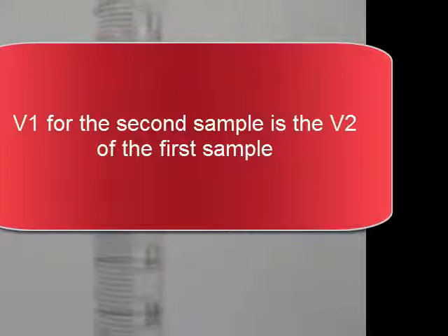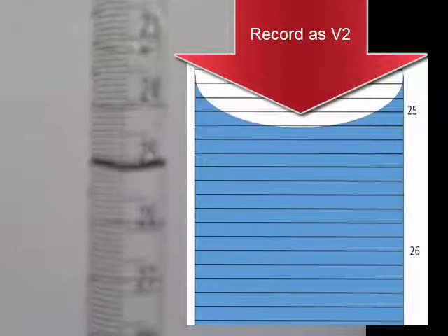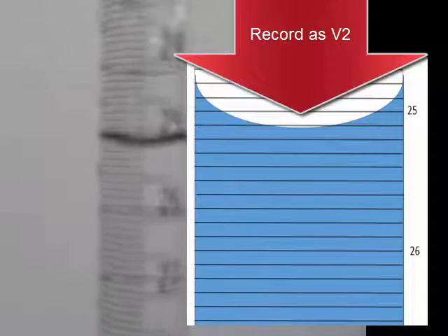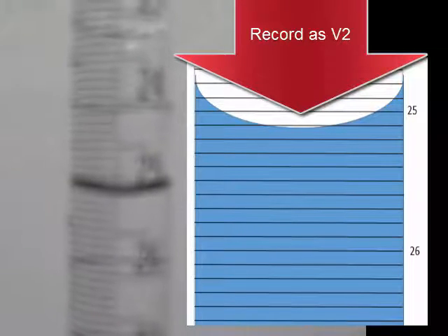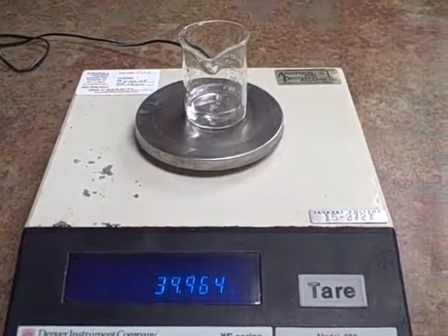Now I'll dispense a second sample from the burette. Your V1 now is your V2 from the previous measurement. I will dispense approximately 10 mils of the salt water solution into the small beaker below the tip of the burette. Now accurately record V2. Now record the weight of the beaker and the second sample of salt water from the burette.